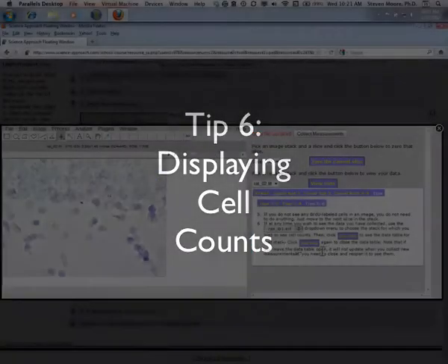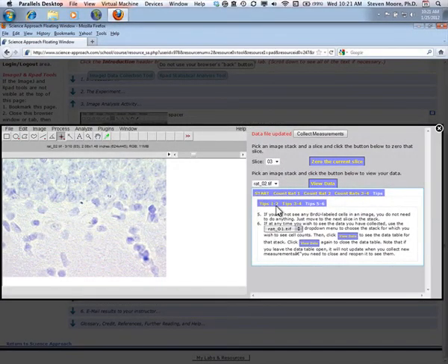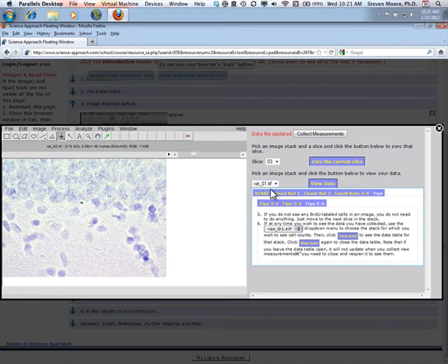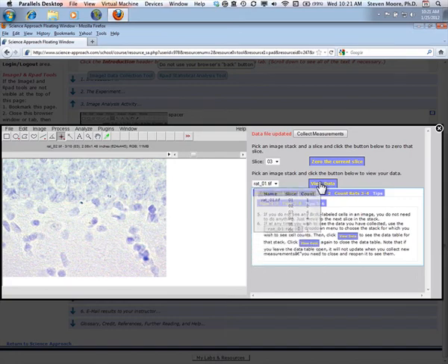You may check the data that you have gathered at any time by selecting the proper stack from the drop-down menu and then clicking the View Data button. After viewing the data tables, just click View Data again.